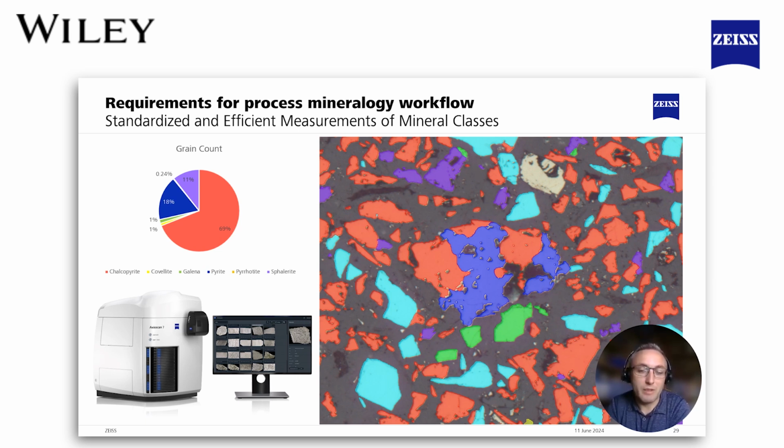Whereas the neat thing about these instance segmentation techniques is you can either pull out individual minerals from an old model. You might have had 4 minerals over there. You want to use 2 of those same classifications in an entirely new model with a bunch of different minerals. That works just as easily. You don't have to start again just because I've got a new combination of minerals in a sample.